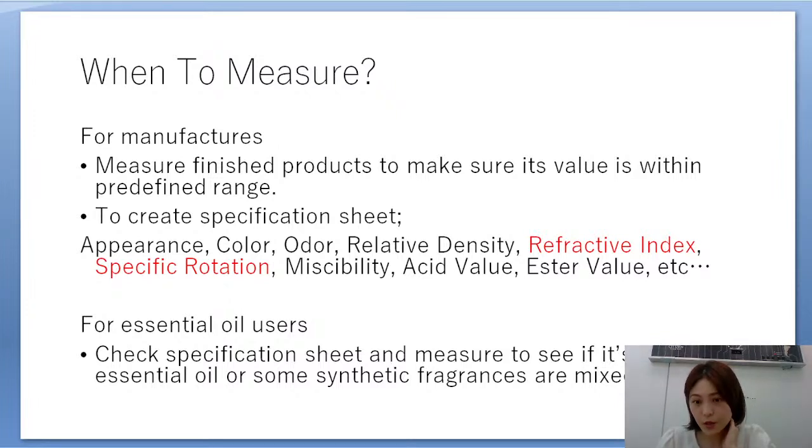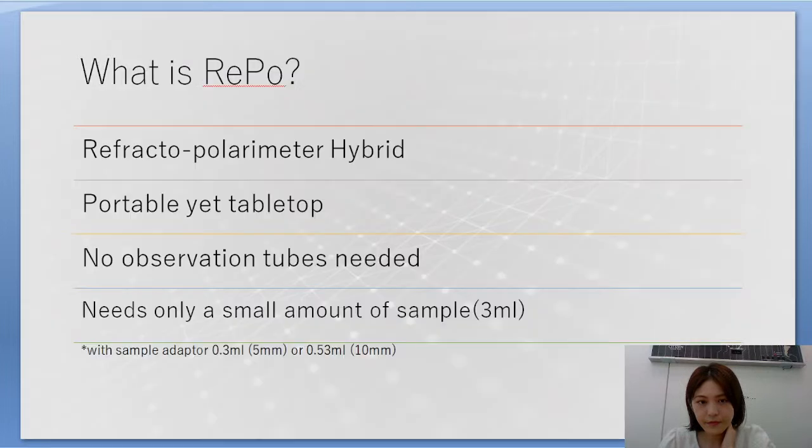Among the items on the specification sheet, our instrument REPO5 will be measuring refractive index and specific rotation. For essential oil users, the instrument is used to check the specification sheet or to determine whether a product is pure essential oil or a synthetic fragrance that has been mixed in.